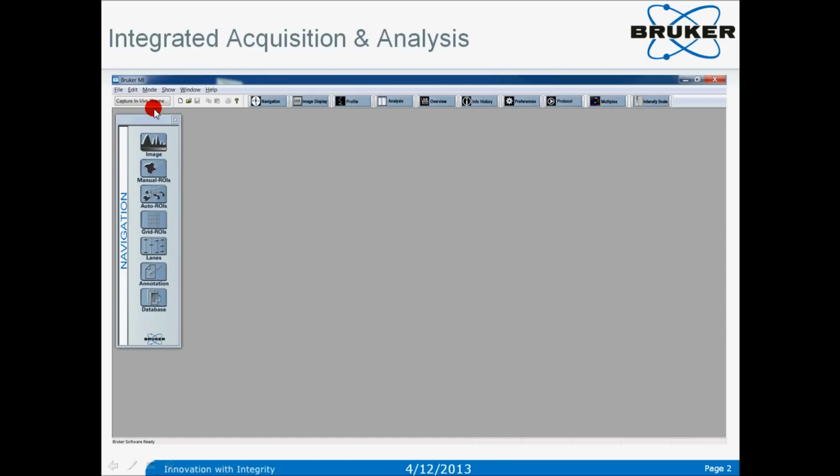For the software installed at the control unit, a Capture in Vivo button has been activated. From this menu, we can drive acquisitions. In the overhead toolbar, there are several buttons that activate menus for data analysis and image preparation.